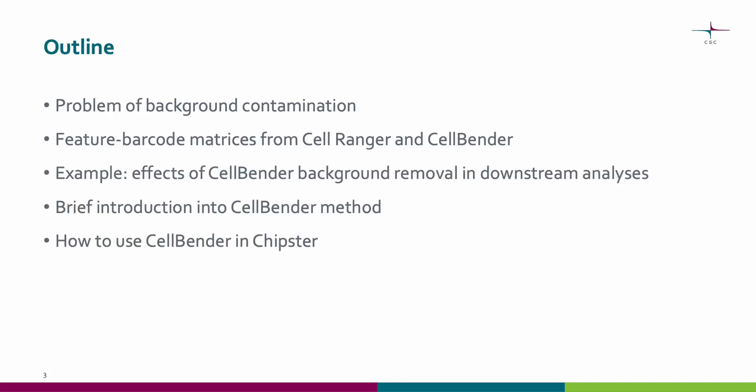We will first go through the problem of background contamination in single cell RNA sequencing data. Then we will compare the feature barcode matrices generated by CellRanger and CellBender. Then we will go through an example to show why CellBender could be useful before downstream analyses. After that, we will briefly go through the CellBender method. Finally, we will look at how to use CellBender in Chipster.